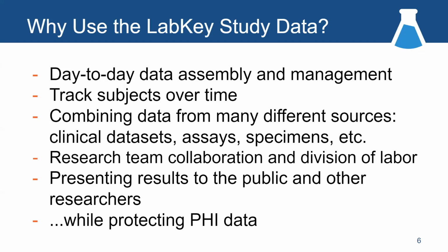The first thing that comes to mind is, why would you use LabKey Study for this kind of stuff? Well, it's a great tool for managing the data on a day-to-day basis. These kinds of studies sometimes take years to complete, and the data trickles in bit by bit, and you need a place to put it, centralize it, tie it all together, do quality control on it.